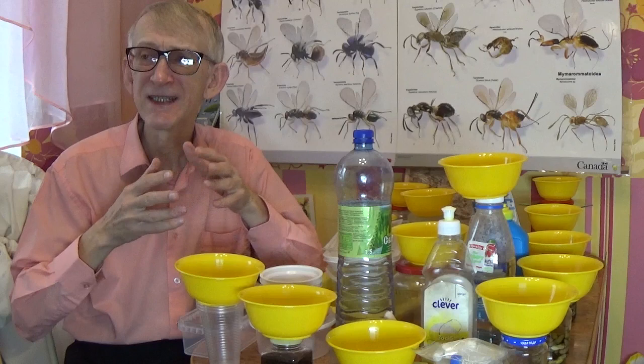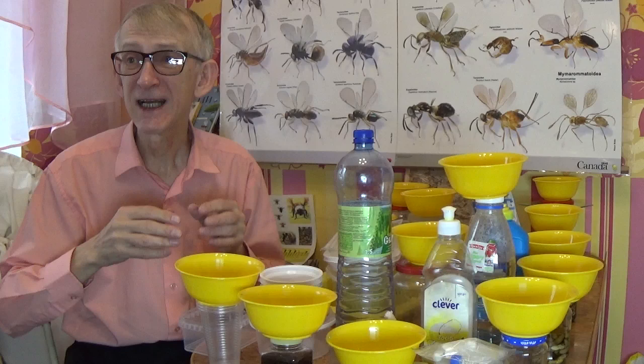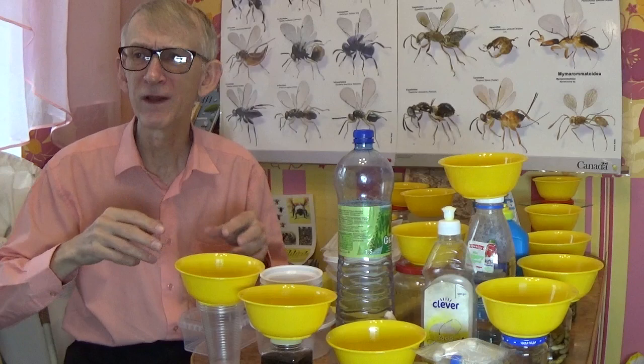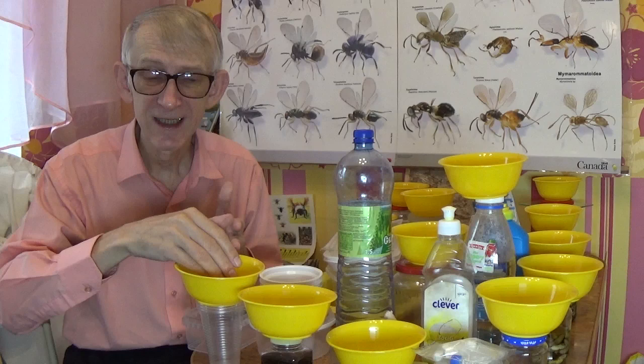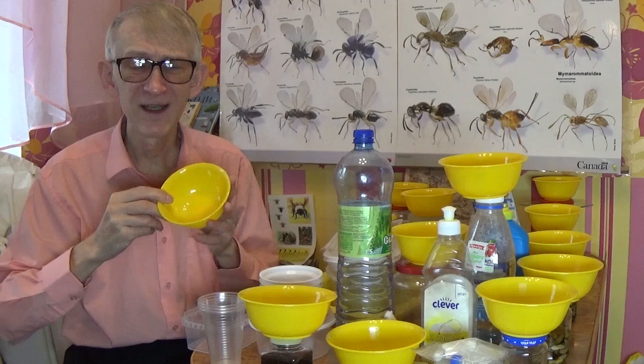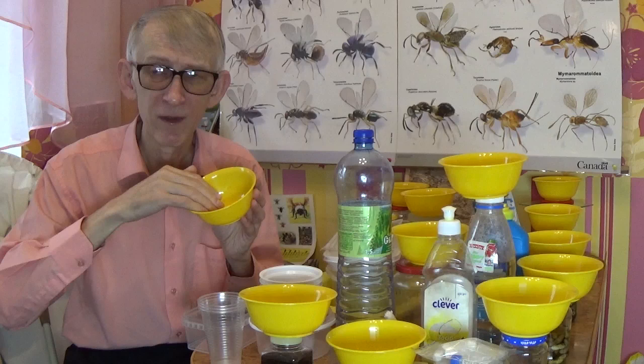These are yellow pan traps. We collect insects and other arthropods inside these traps because they are filled with water, shampoo, and salt. Insects are attracted because, from their perspective, the yellow plate looks like a big, very attractive flower — so they come, walk around, and are drawn inside.